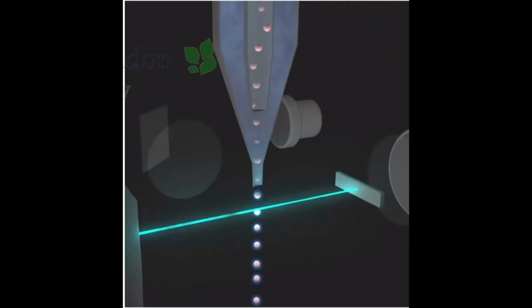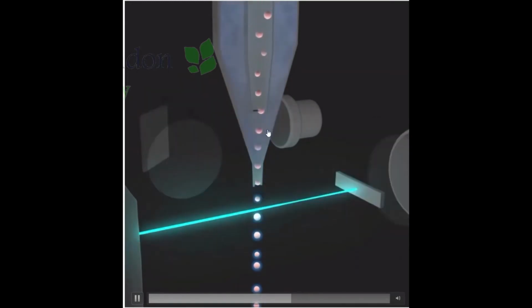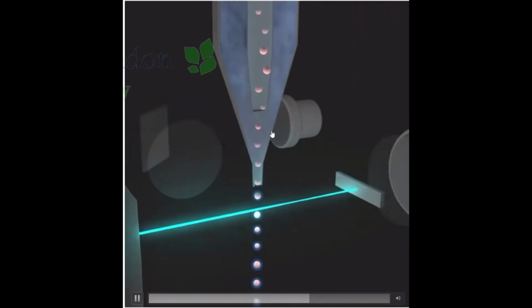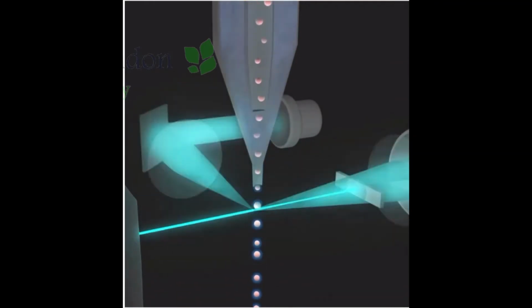Due to narrowing of the sheath in a nozzle or cuvette, the fluid velocity is increased. So this is the sheath fluid, and this is called the cuvette. When the sheath runs and the fluid velocity increases, the cells in the sample introduced into the center are focused by the Bernoulli effect. This allows the creation of a stream of particles in a single file and is called hydrodynamic focusing. Under optimal conditions, laminar flow, there is no mixing of the central fluid stream and the sheath.